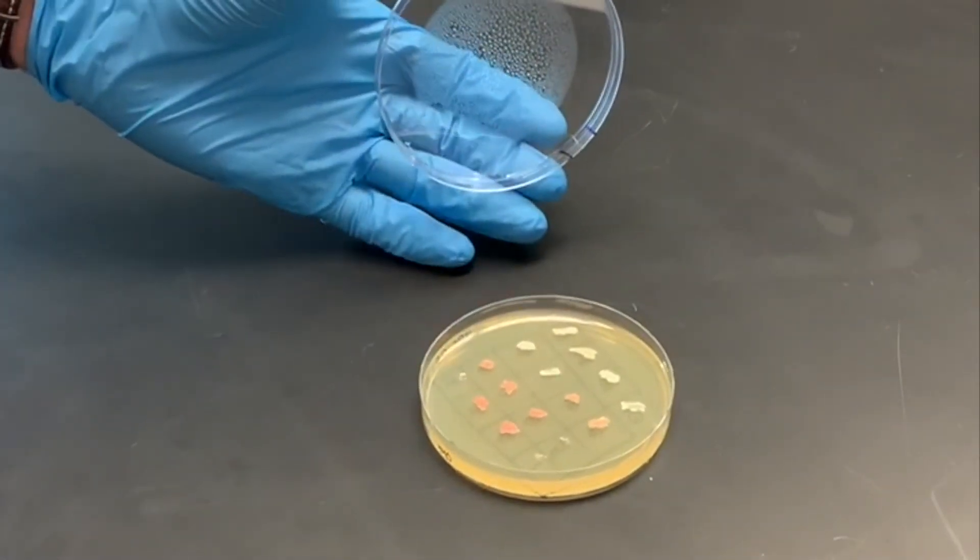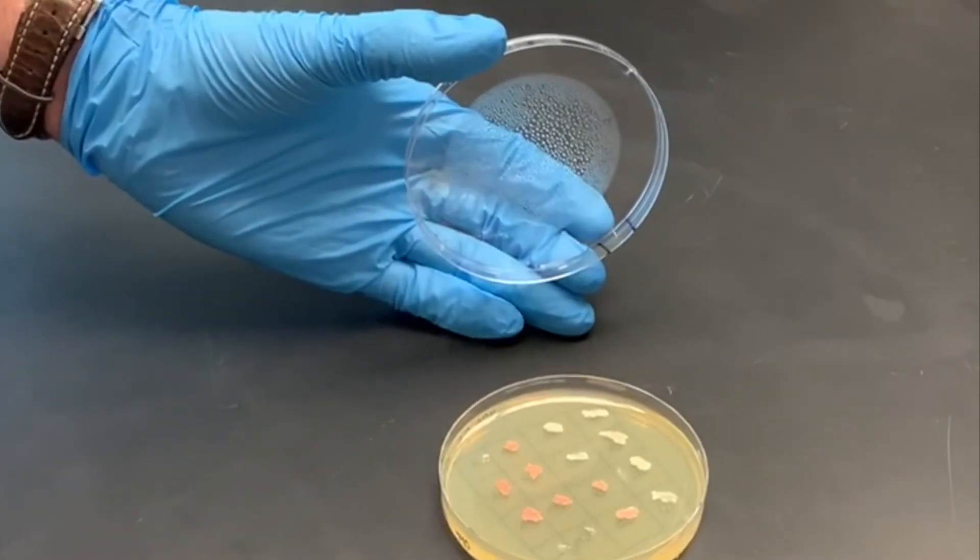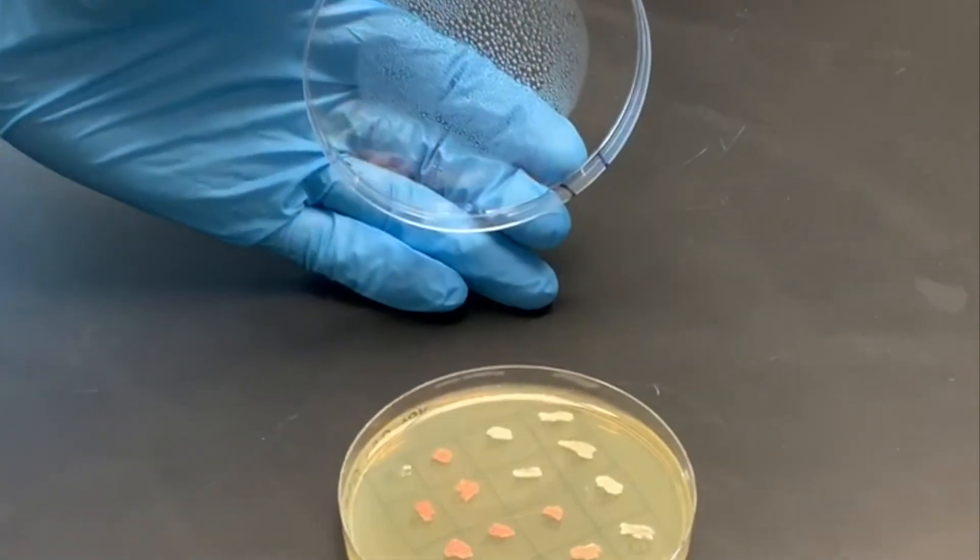In our lab, we were able to assemble a plasmid capable of knocking out the AD2 gene in yeast through CRISPR editing, producing a red phenotype.